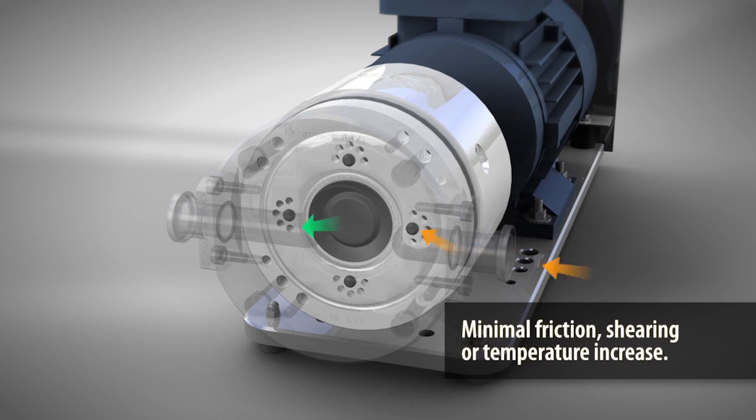There is minimal friction, shearing, or temperature increase. Shear-sensitive products are gently moved through the chamber safely.